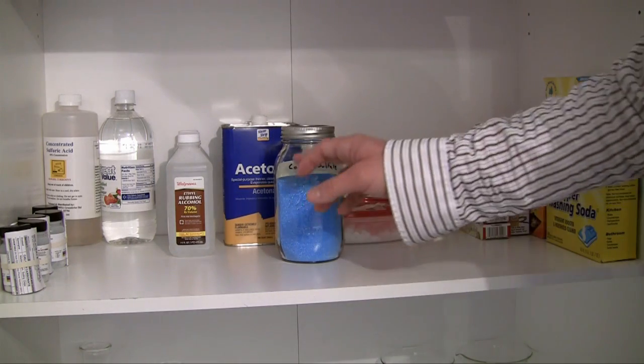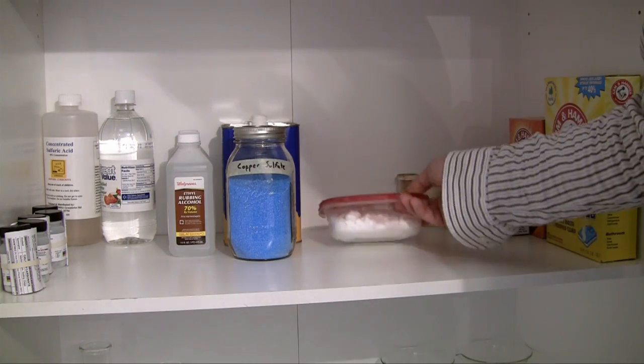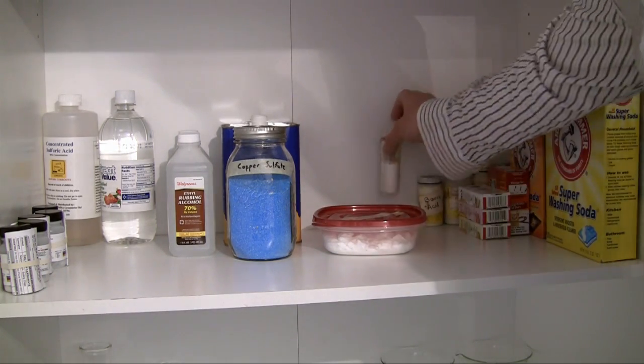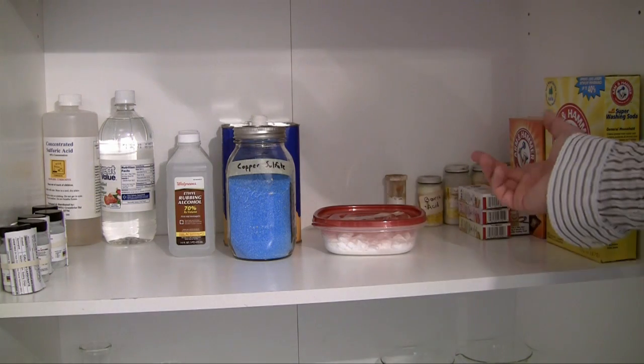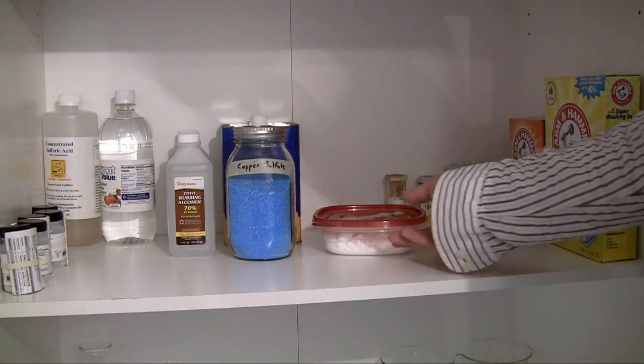Another thing, of course make sure to label everything. A lot of these chemicals look the same. For example this potassium chlorate and boric acid they pretty much look the same as baking soda so if they weren't labeled it would just be a guessing game. Not very good.